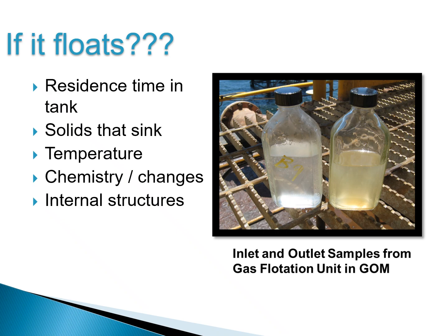image because every time that you see a presentation or a discussion about oil water measurement, oil water separation, everybody's going to have a picture of a bunch of different bottles, and the one on the right will be dirty black, and the one on the far left will be nice and clear. So look how my water treatment system is working. And so it's just a common image that we always see.